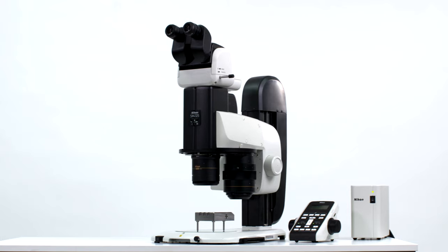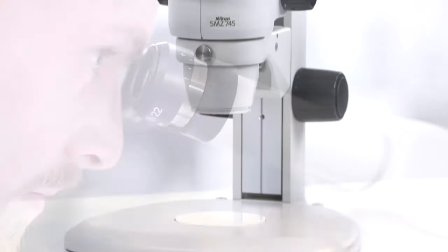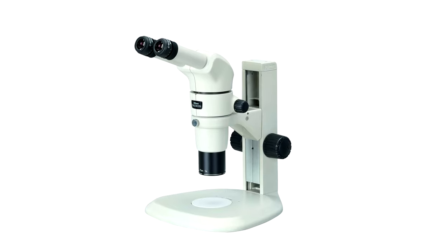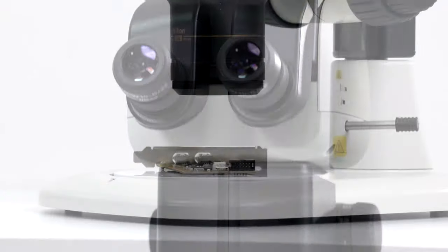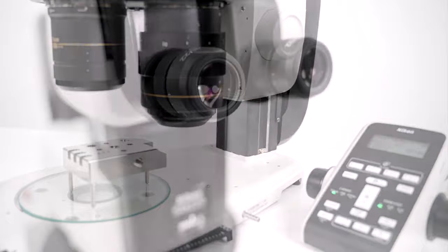Nikon offers a really wide range of stereo microscopes, from the entry-level SMZ4 series to high-performance SMZ745 and 745T, then on through to the SMZ800N and the SMZ1270i, up to the very high zoom range ratios of SMZ18 and top-of-the-range SMZ25.